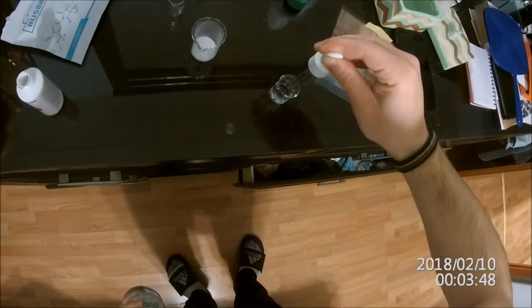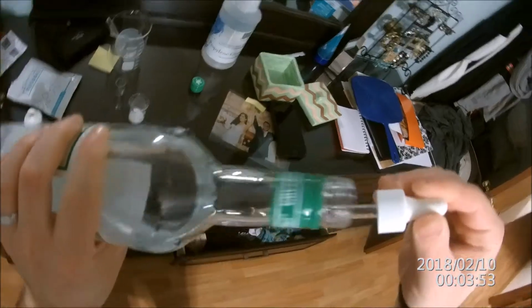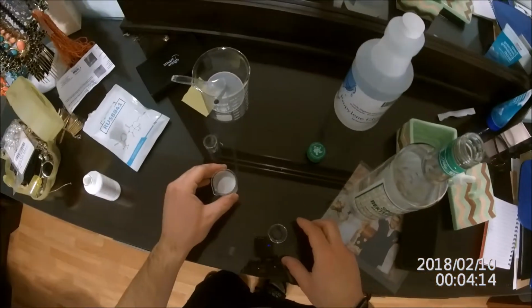And it's a little bit less than 1 milliliter, so I know I need about 0.25 more. And again, you get it as precise as you can. I mean, that 70-30 isn't written in stone anywhere. It's just what people think it should be. And I generally think the ethanol is what penetrates the skin. The propylene glycol is the vehicle that gets it to the skin. So both of them are important.